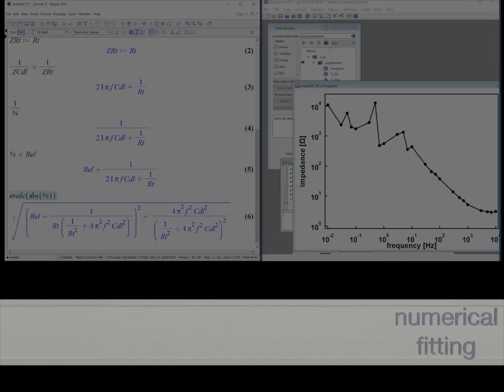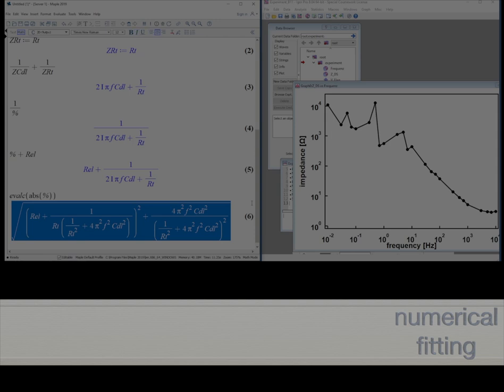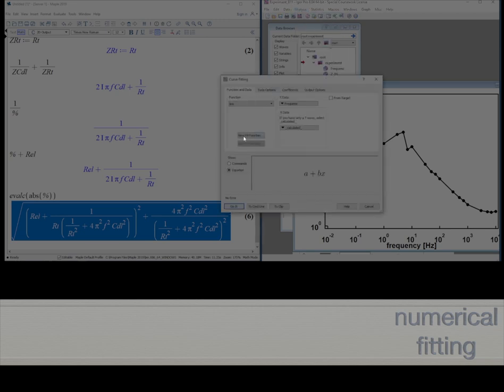Now we put the windows of Maple and Igor side by side on our desktop. Then we carefully copy and mark the result of Maple calculus. Then go to Analysis in the Igor dialog, go to curve fitting, and then we introduce a new fit function. We call it, for example, bode_fit. Now we go to the function and press ctrl V. There's the result of Maple in Igor. That's fine.